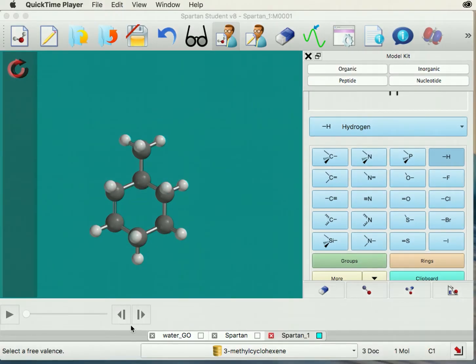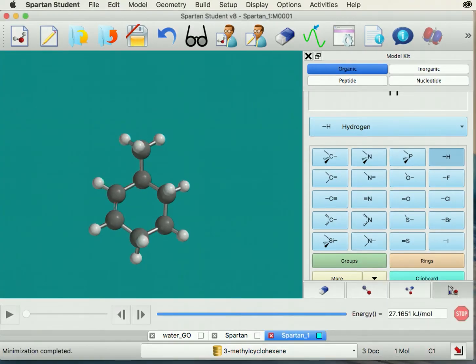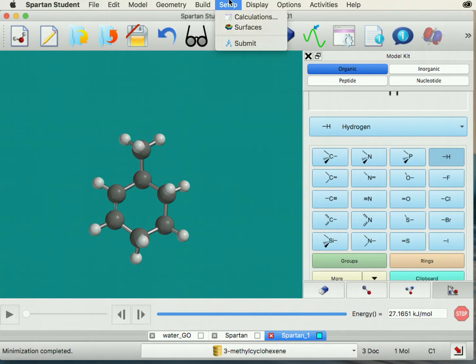Now you will perform an energy minimization. Once you see minimization completed, perform a geometry optimization.